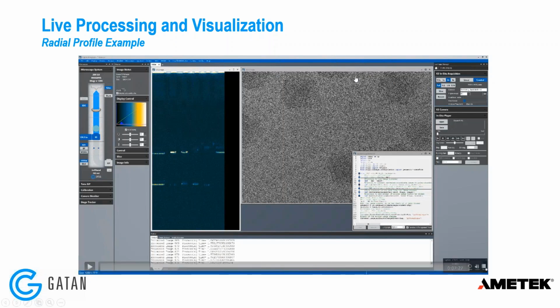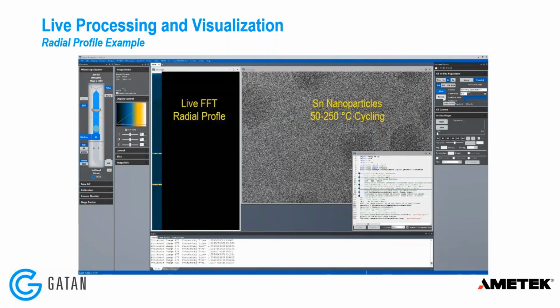And again, this is processed live. I'm not processing all of the data. The camera is very fast. It's producing a huge amount of data. But every second or so, I get a display from the live view and process that and put it into my result image.